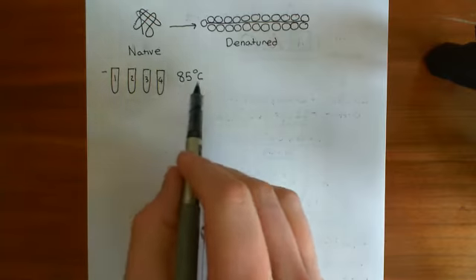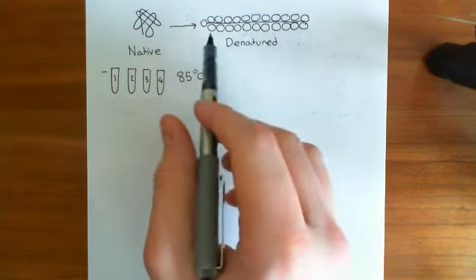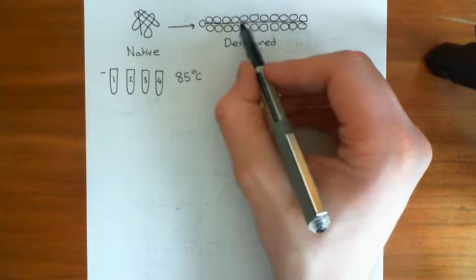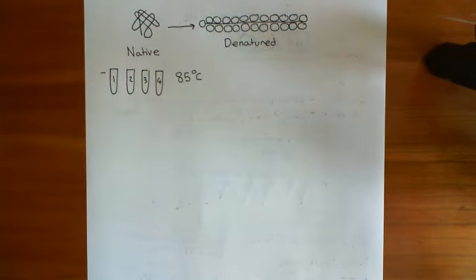So even when you now cool it back down, it won't return to its native state because it's surrounded, basically. It can't. All of the groups are now surrounded by dodecyl sulfate anions and therefore can't physically interact with one another. So that's the purpose of the SDS or the LDS, to maintain the proteins in their denatured form.